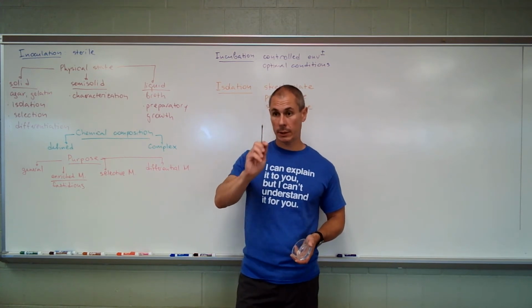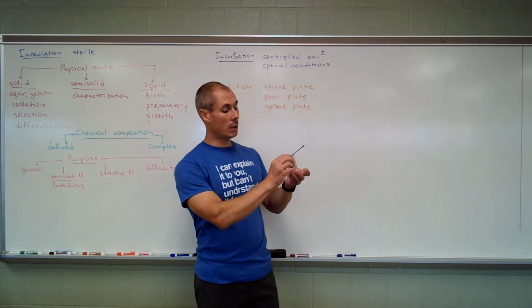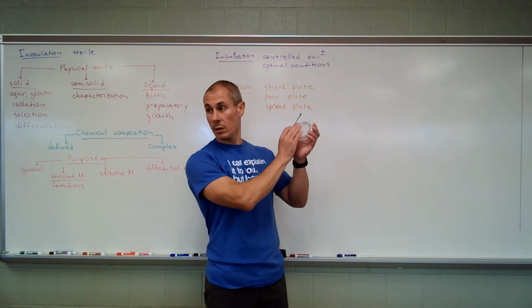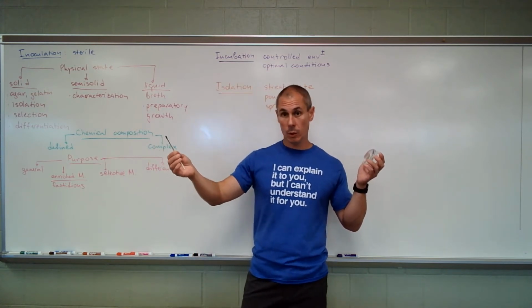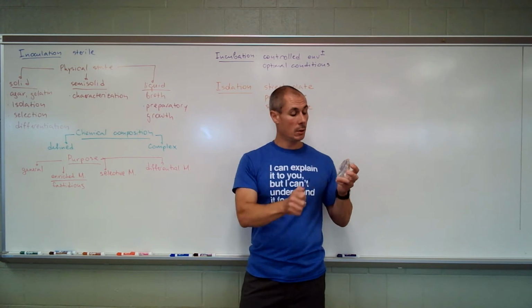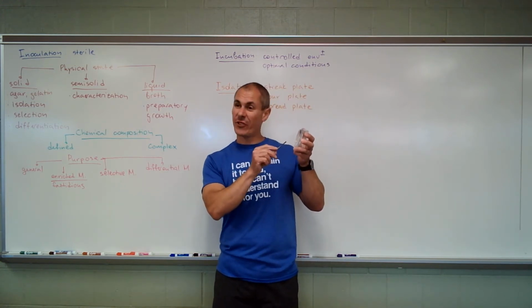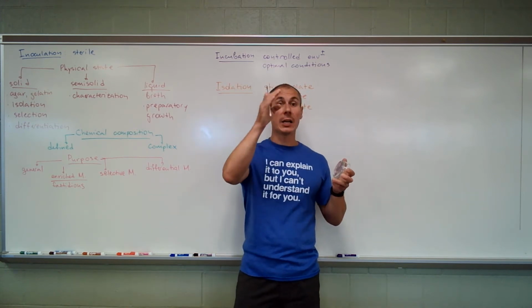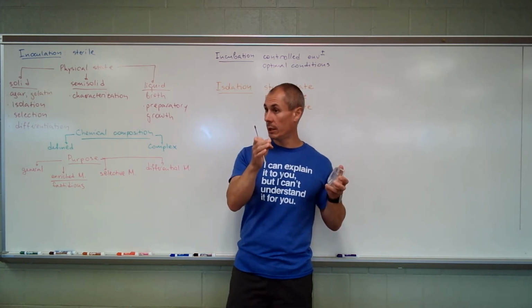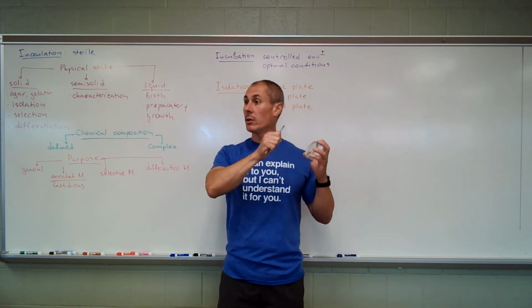So how can you know? Use the sterile wire loop. You tap the colony, and you make a little streak. Imagine that this is the agar. You make a little streak on the agar. You sterilize the loop in the flame. Take a small smidge of that first streak and spread it over an uninoculated surface on the agar. So you're thinning it out. And then you're thinning it out again. And you're thinning it out again.